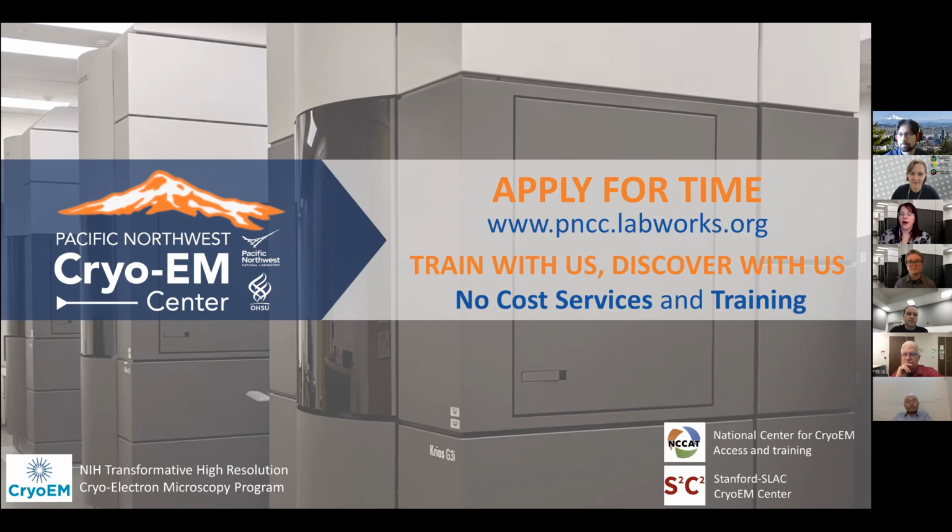How do you apply for access at our center? So at PNCC, applications are due every month on the 1st at 11:59 p.m. Pacific time. We currently leverage the EMSL user portal for all of our applications and proposal tracking. In general, it takes about 40 days from the 1st for proposals to be reviewed and receive an award letter.